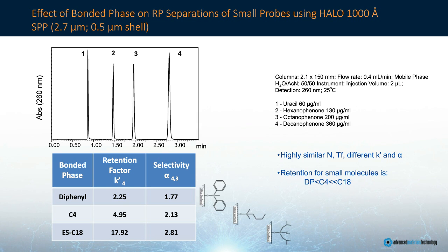You can see that the retention factors vary across the bonded phases, as do the selectivity factors. Each of these phases are highly similar in terms of their efficiency and tailing factor, and like I said, they exhibit different retention factors and selectivity.